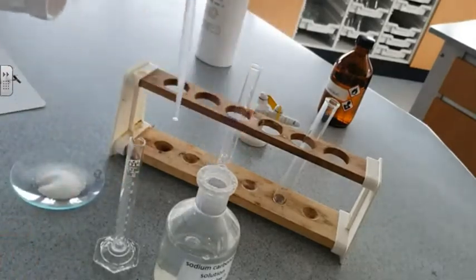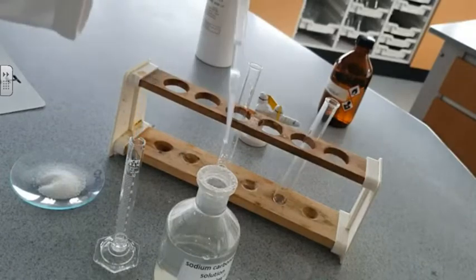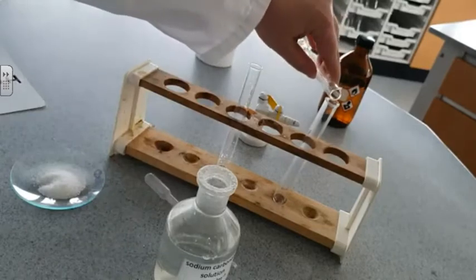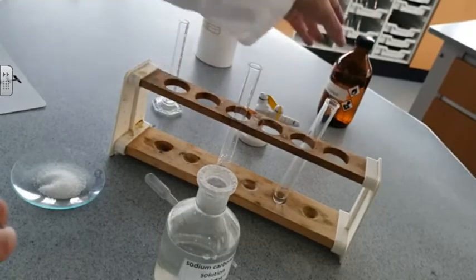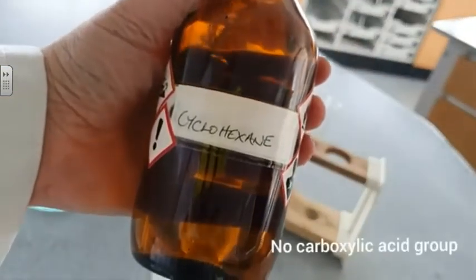Just to prove that this doesn't happen with everything, and this is a test for a carboxylic acid group, I'm going to show you the reaction of sodium carbonate solution with an organic compound that does not contain a carboxylic acid group. So we've chosen cyclohexane.